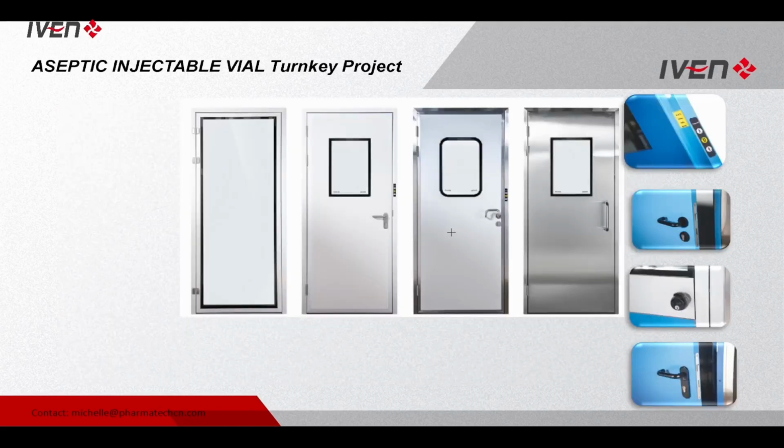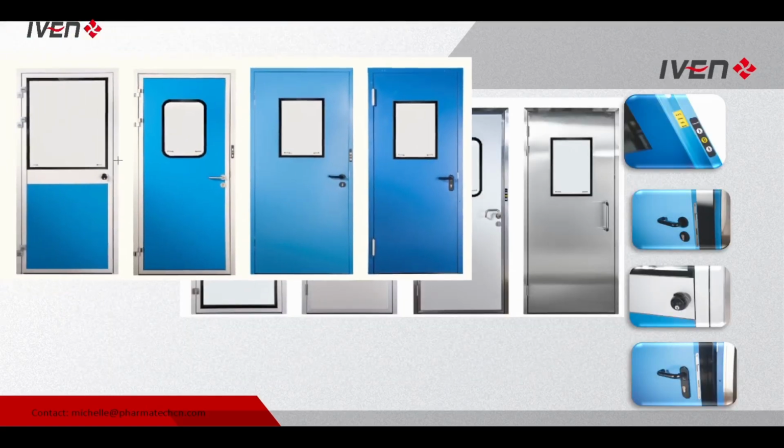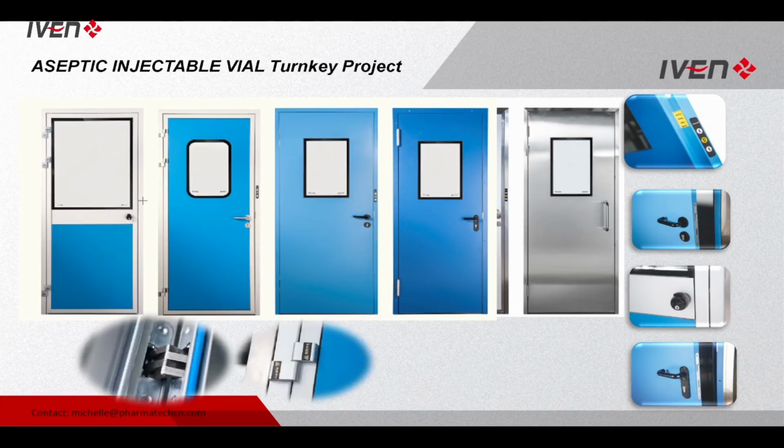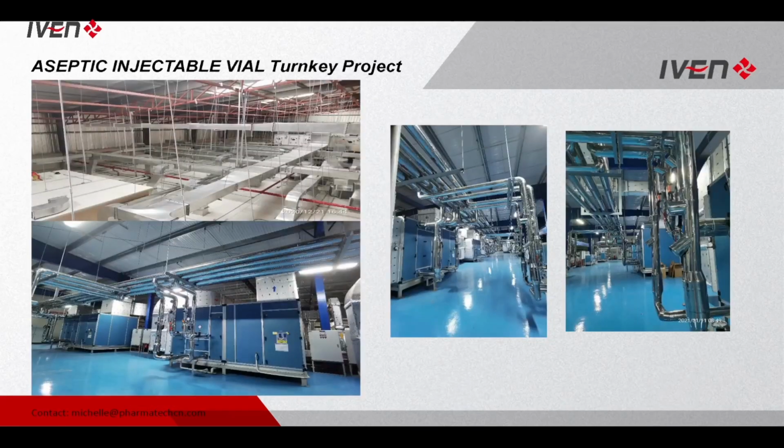We also have different kinds of clean room doors, like aluminum clean room door, steel door, and stainless steel door, and also different kinds of hinges and door handles. We also have the interlocking system. I also introduce our air ducts and the AHU system. For the AHU, we also have different brands for your selection.